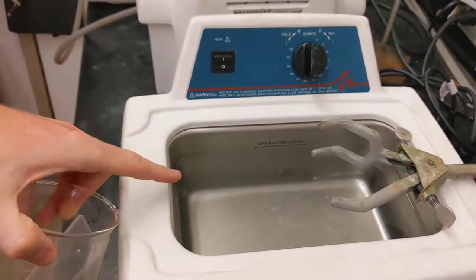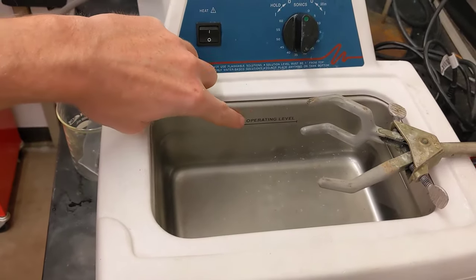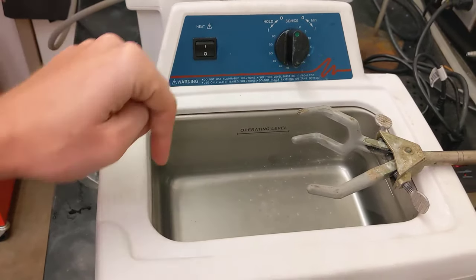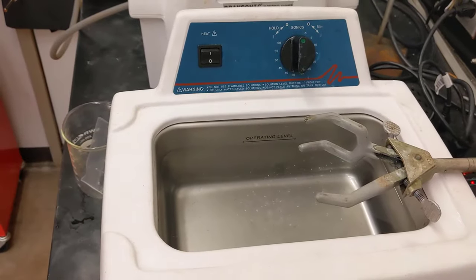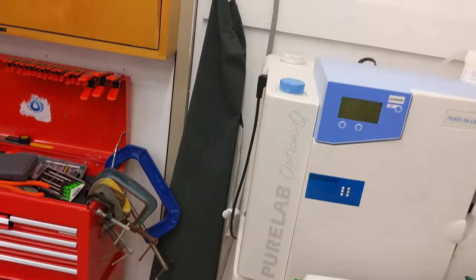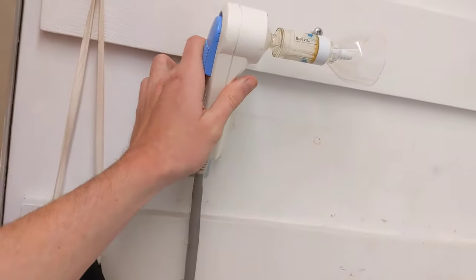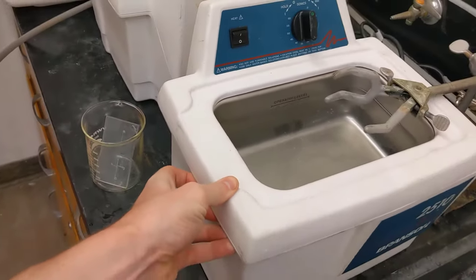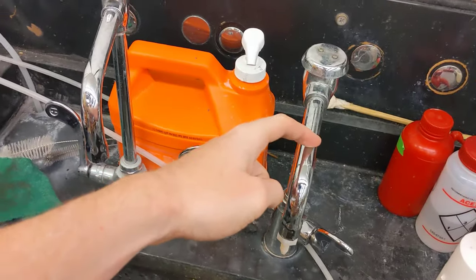Inside of this bath, you want to keep it filled with DI water up to the operational level. You can go a little bit above or below it, but you don't want it significantly lower than the operational line. You can use either the wand here to fill up the bath, or lift the entire bath up and put it in the sink and use the DI tap to fill it up.